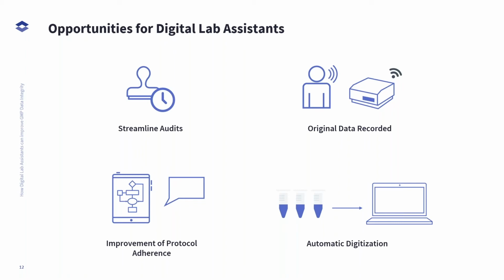In order to measure your SOP compliance and improve it, and therefore be successful in inspection, all this digitization will make everything easier, to follow up and improve your KPI measurements and therefore your performance.